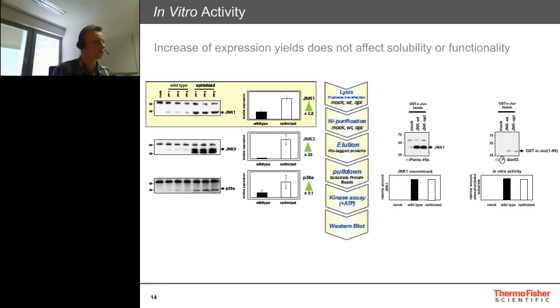What we did is we purified the protein, eluted it from the His-tag, from nickel agarose, and did a pull down on substrate protein beads.